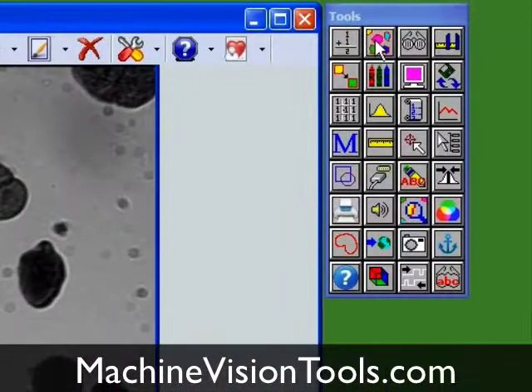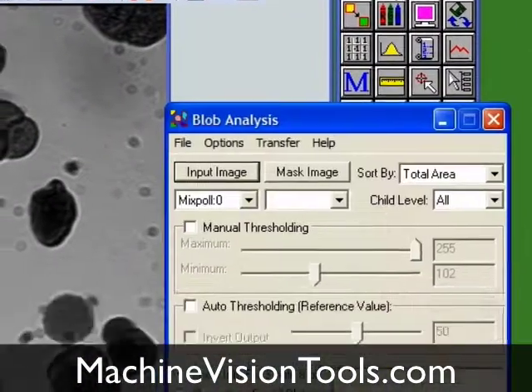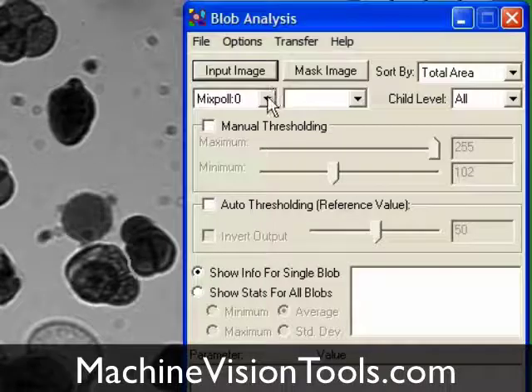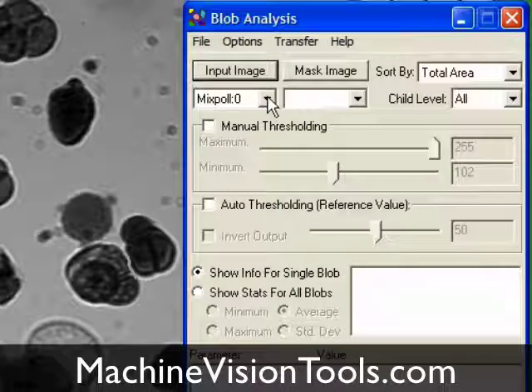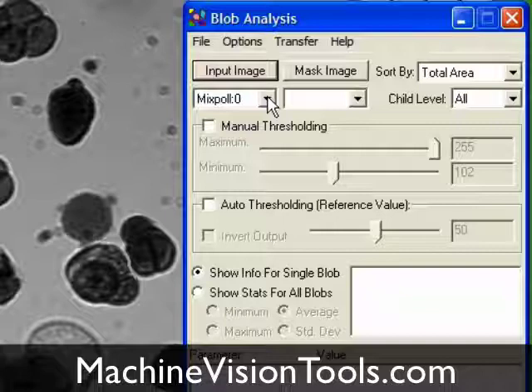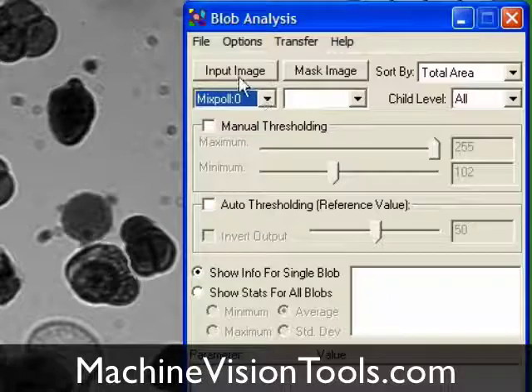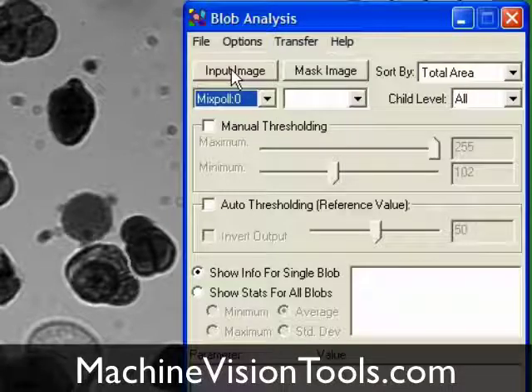With the image open, we'll launch the Blob Analysis Tool. Since the image was already opened and active when we launched the tool, it's automatically selected as the input image. If it hadn't been, or if we wanted to select a different image, we could select it from the dropdown or activate the desired image and click the Input Image button.